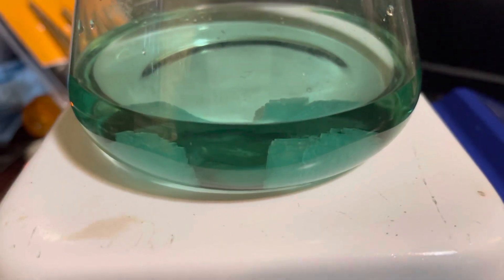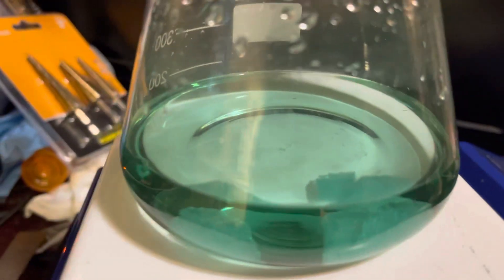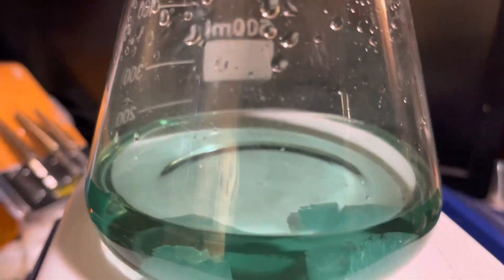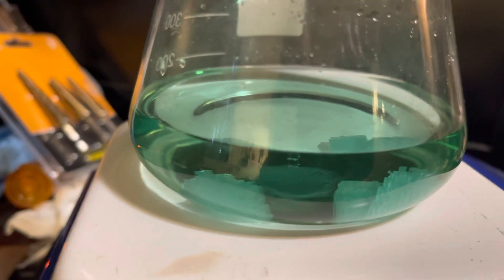Here is a flask I have with some ferrous sulfate in it. As you can notice, all the little droplets all the way up — none of them have oxidized into the ferric ion. So this is all in the iron(II) state.